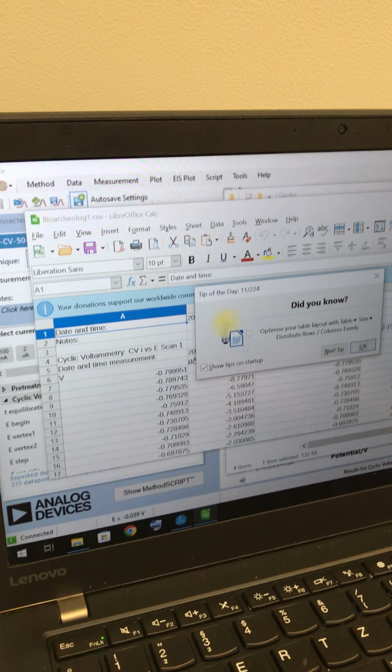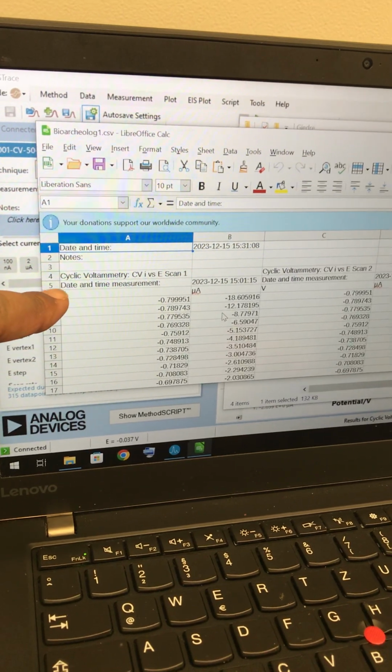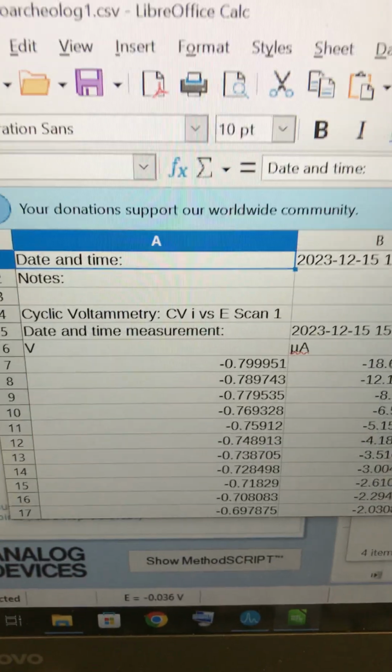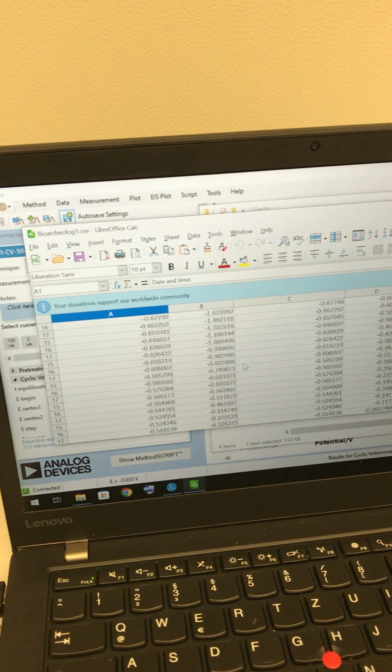Let's have a look quickly. Oh, nice. Okay. Yeah, and then later you might use Python coding to plot it, analyze it, take notes, find the maximum, and so on. Can you give any hint, like what does it actually say? Cyclic voltammetric scan 1, 2, 3. What do you see from those graphs? What does it say by looking at it?